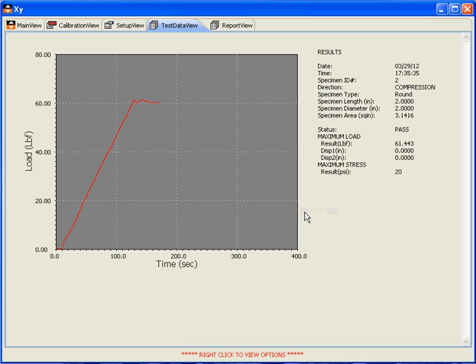This concludes how to set up a compression test using the XY plot software.